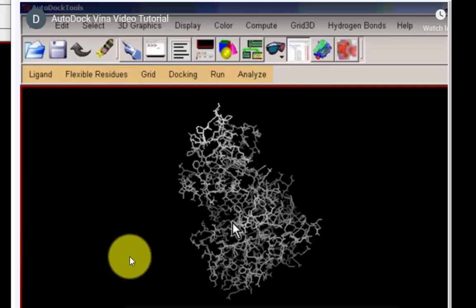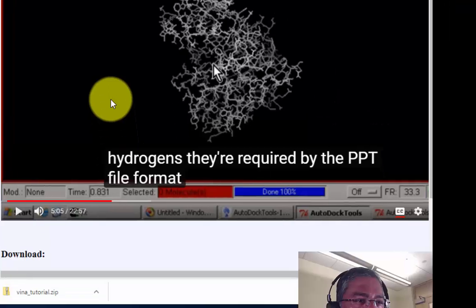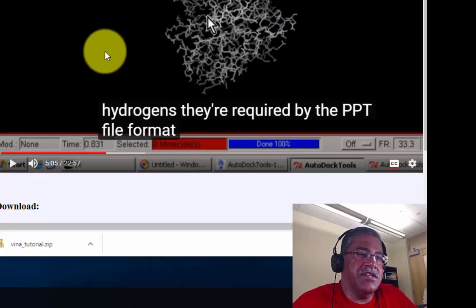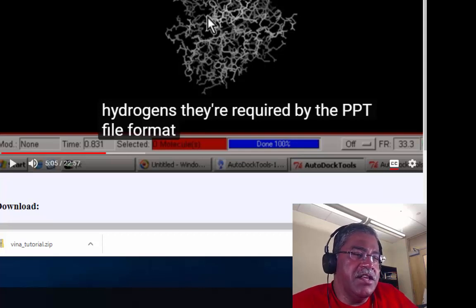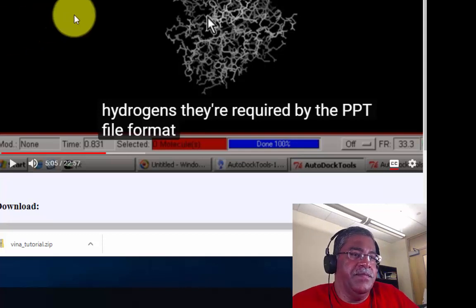The way this video is rendering, it doesn't look like you can see many of the hydrogen atoms, right? So this black and white is obviously an older version. The version that we are looking at here is a newer version, and so you can tell that the hydrogens have been added. It's a lot more stark.